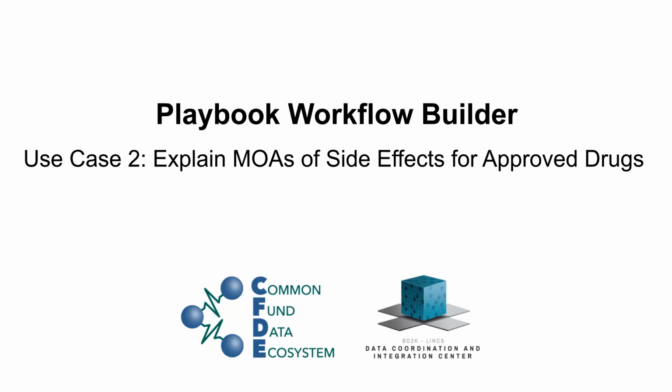This video is a tutorial about a use case workflow from the Playbook Workflow Builder. This workflow was designed to explain MOAs of side effects for approved drugs of the Playbook Workflow Builder. This use case focuses on gaining insights into the potential mechanisms of a drug by analyzing genes that are differentially expressed in response to drug perturbations in human cell lines from the LINCS L1000 data.